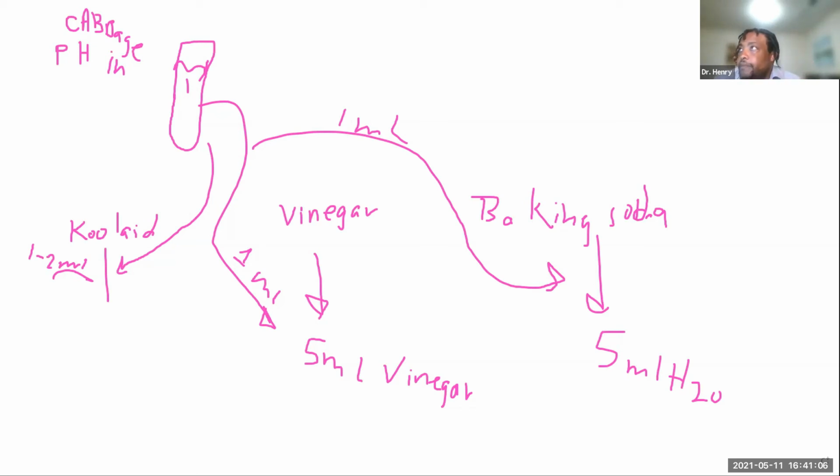Okay. So for my lab, the pH strip was kind of like an orange, so I put it like a 2. But when I used the cabbage indicator, it was more of a 1. Like it's really red still. Okay, so then just record both, you know? Yeah. It's okay.